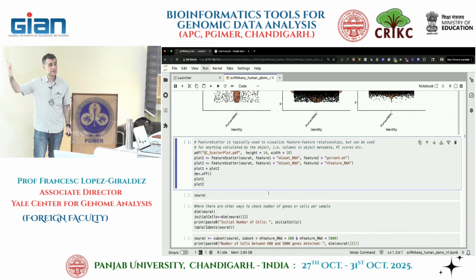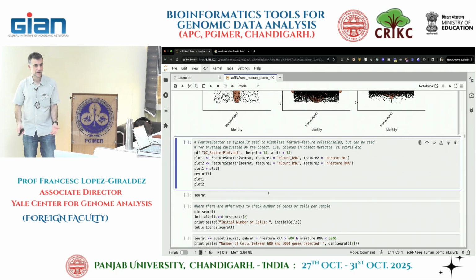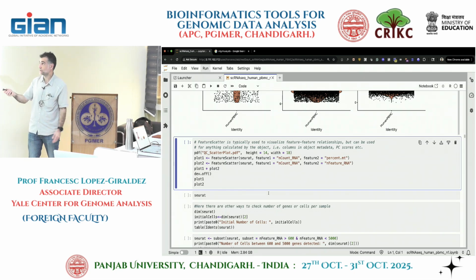Yes, you have that in the 2,162 genes they were showing, right? In 10,000 cells, the approximate gene number was 2,000. So if the average was 2,000, it's 2,000. The average is really hard to read here, but maybe you can.